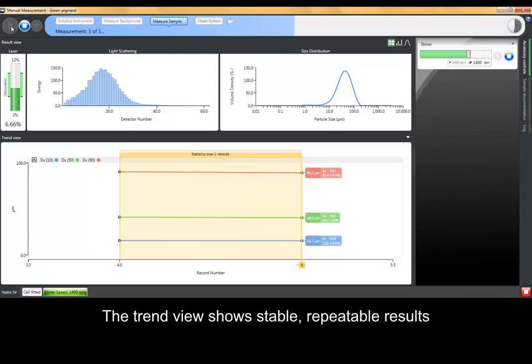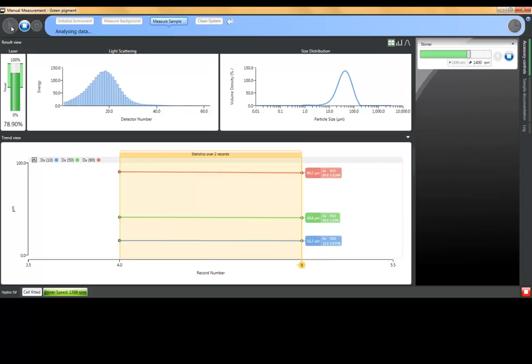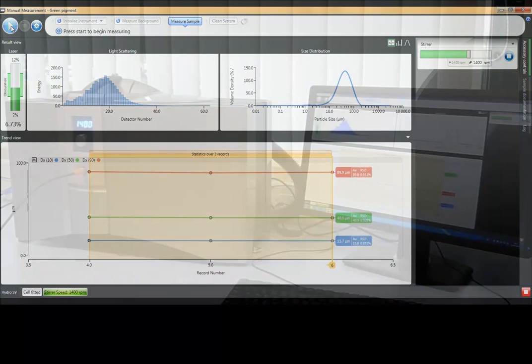The repeat measurements that we have made are built up into a trend view. And this shows stable repeatable results indicating that this green pigment sample is well dispersed and suspended on the Hydro SV.